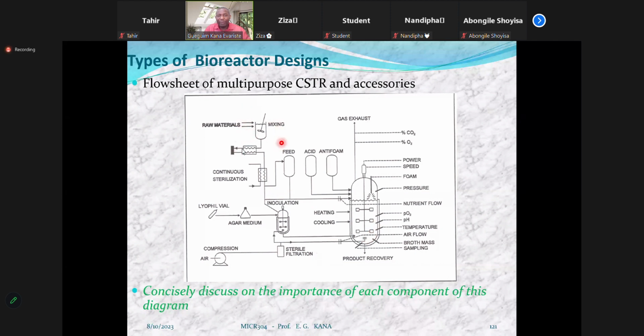That is, you have another tank here in which the nutrient is formulated, properly mixed, and sterilized. After sterilization, it feeds the inoculum reactors as well as the production reactor. The medium is sterilized to feed all the reactors in the inoculum development chain, and part of the formulated and sterilized medium goes into the reactor.